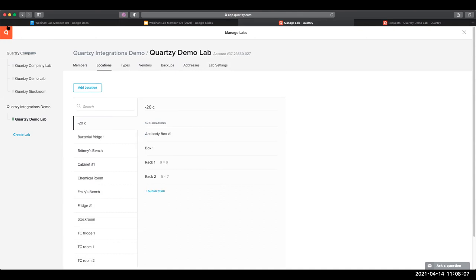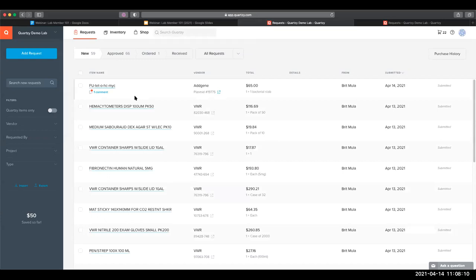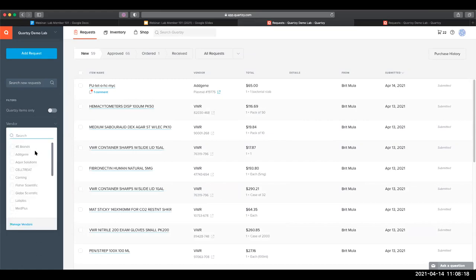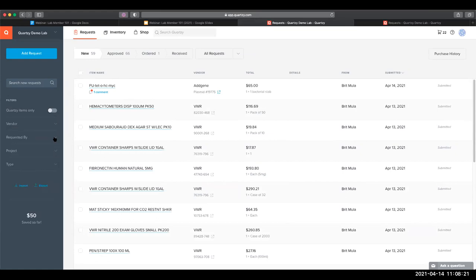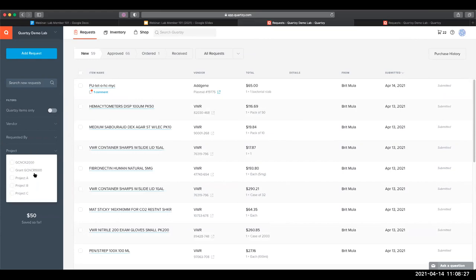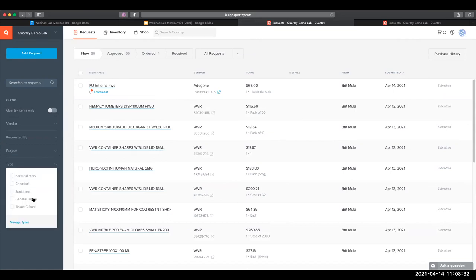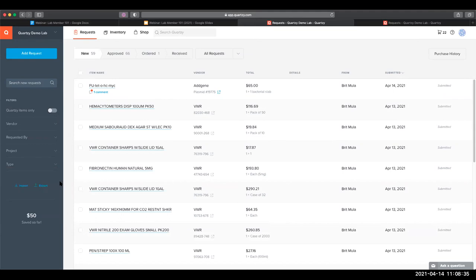So let's go over to the request module here. You have your search bar and filters on the left-hand side. You can filter by vendor, by requester, and then your grant ID, project code, or account number, whichever spend tracking code your lab is using, and then the type or category of that request. This new tab can be thought of as your lab's digital shopping list. These requests have been recently submitted by someone in the lab and they're waiting for a lab admin to approve them and place an order.